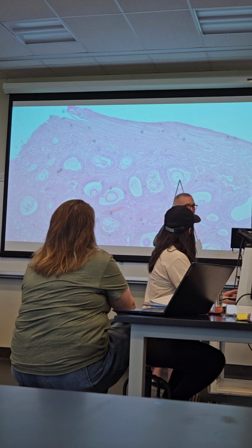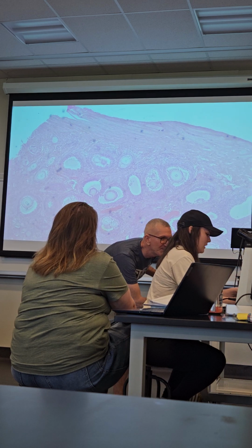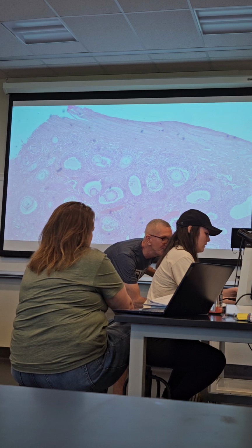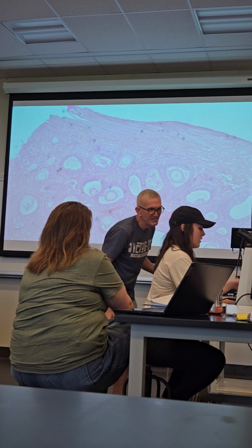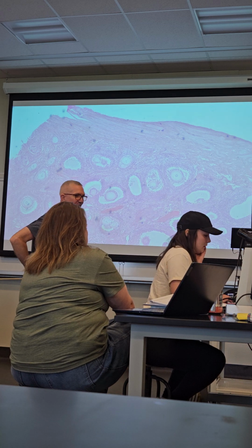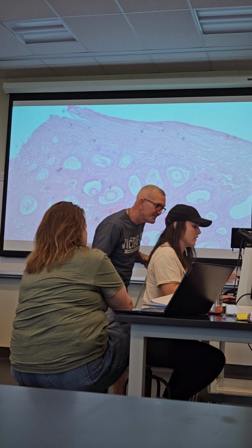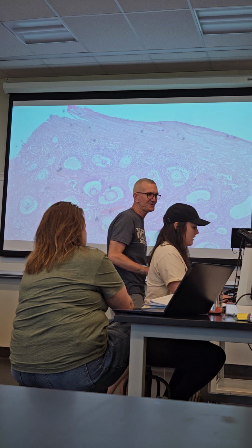Yeah. So granulosa is on the outside, zona pellucida. That one would be primary because it looks like it got torn when they made it. I wouldn't use anything wacky like that. What does it say on the thing? Oh, it says primary. And that's a bad spot, that should be in there.